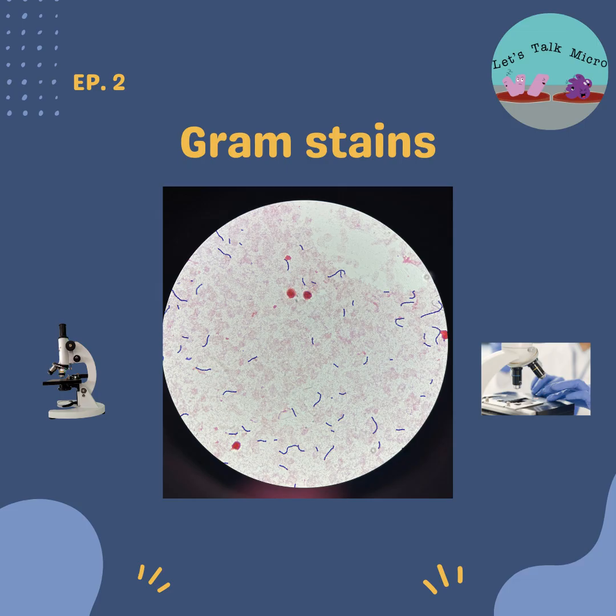We use different types of agar or media in the lab, and they all have a different purpose. We have selective agar, differential agar, enriched agar, and nutritive media, and like I just mentioned, they all serve a purpose. Blood agar, for example. Blood agar is the most popular agar used in the lab. By popular, I mean the most commonly used one, right?